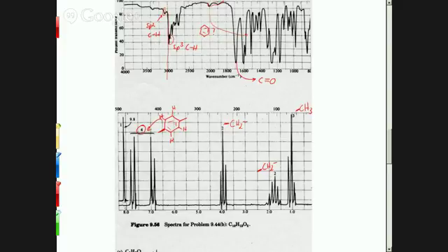There's one more piece that's actually off the scale, so they had to draw it a little bit separately. A 1 hydrogen peak way up at 9.8. This is where you might look at the correlation table. And there's really only one type of a thing that comes in at 9.8. And that is down here, an aldehyde. So a carbon double bond oxygen with a hydrogen next to it is in that range. And it's really the only thing that's in that range. So because of that, we can say with pretty good certainty that this peak over here is probably a C double bond O with an H, and that gives another connection.